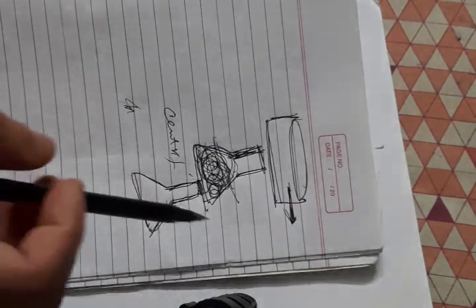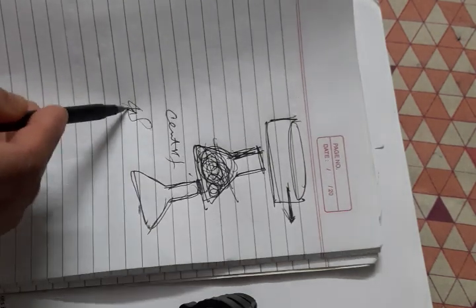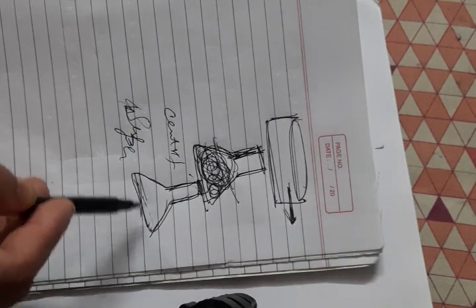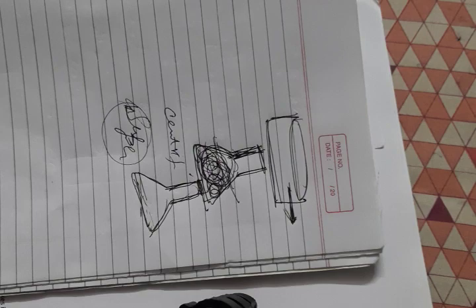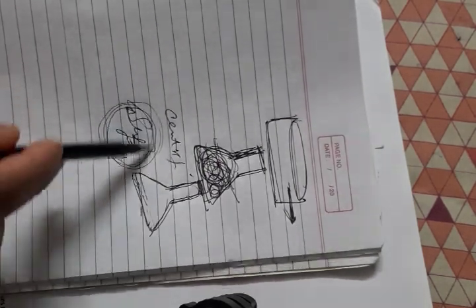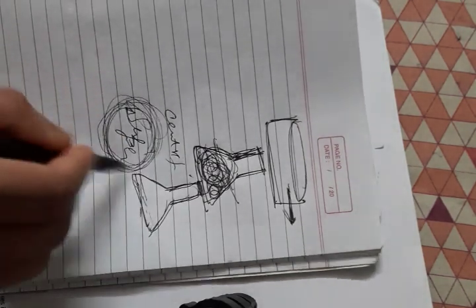But what I found out later is that the supernatant was being collected. The cells were being pelleted out, so we are getting the supernatant. But that supernatant, along with the amylase, also contains some other impurities.